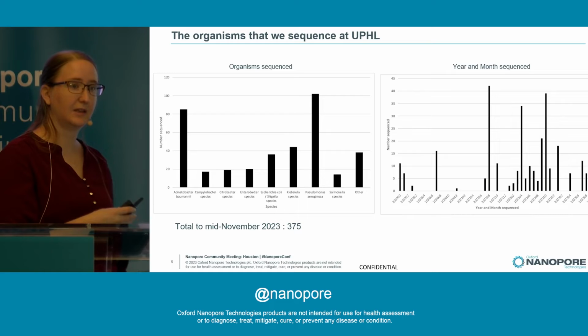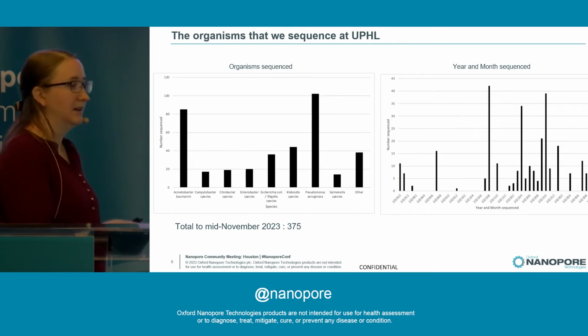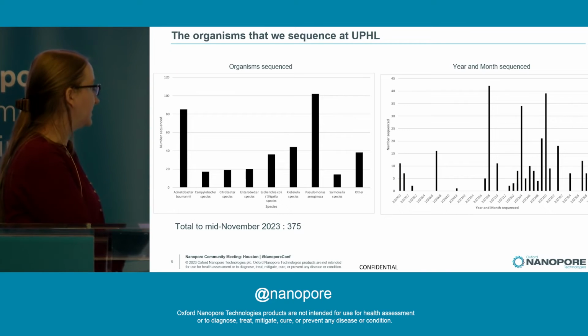So far, it seems like if you have a bacterial isolate and you can extract the DNA, you can probably nanopore sequence it. Also, we do have a few years of experience with nanopore sequencing. We started some nanopore sequencing back in 2019, and then we had a stretch where our energies were focused elsewhere, and now we're back to developing our nanopore sequencing and identifying its utility.